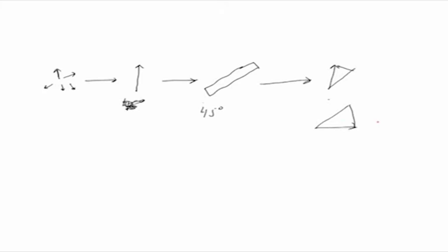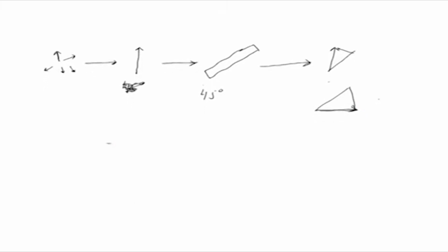Through the analyzer you will be able to pass this particular component, which is parallel to the axis of the analyzer. Now, what is going to happen? If I say this is the rotating stage and, like I said, this is the one oriented at 45 degrees in its arrangement to the analyzer and polarizer, you will see the maximum brightness. This will be a bright crystal, or a bright image will be seen of this particular material.